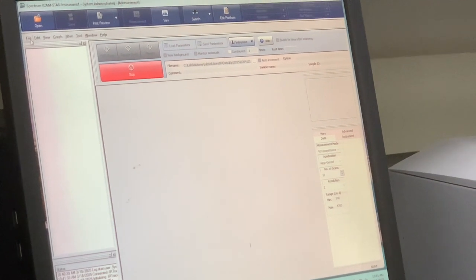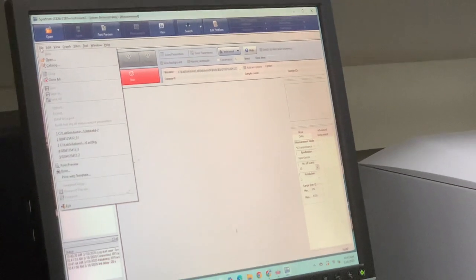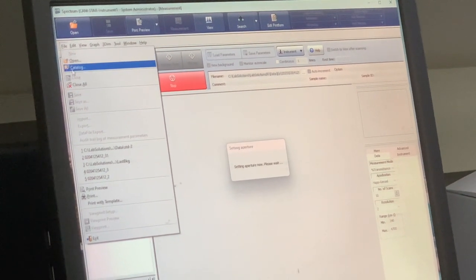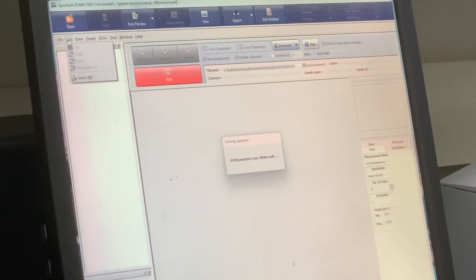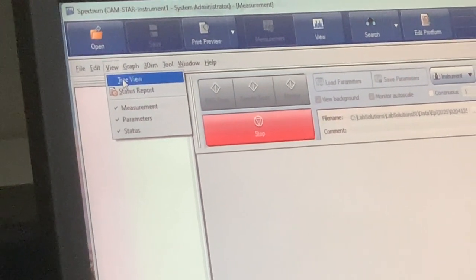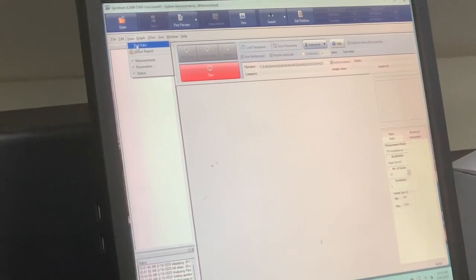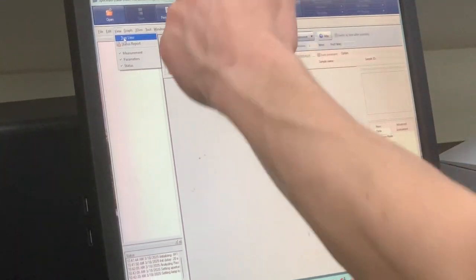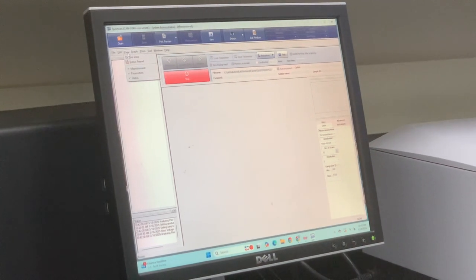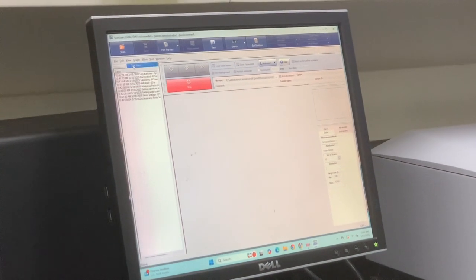So here's another menu that you want to pay attention to. File and edit are going to be self-explanatory. You can open your files, you can open your catalog, and edit is the simple edit commands. View is important. For example, this is the tree view. It's looking at where your files are stored. As you open files, that's where they'll appear, in a tree, like level 1, and then indented to level 2, level 3. If it's already showing and you click it, it will hide it.